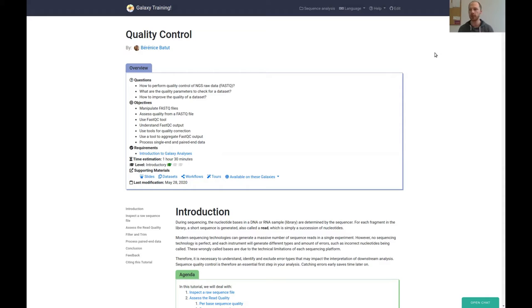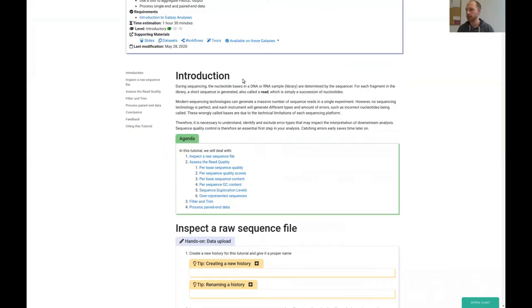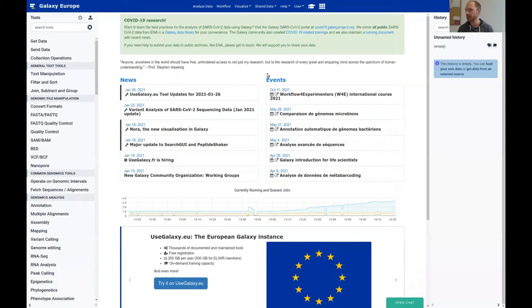Pause the video until the import or data analysis is finished, then continue. I'll always mention when there's a break. Okay, let's come to the hands-on — you can read the introduction a bit. In the meantime, let's go to Galaxy.